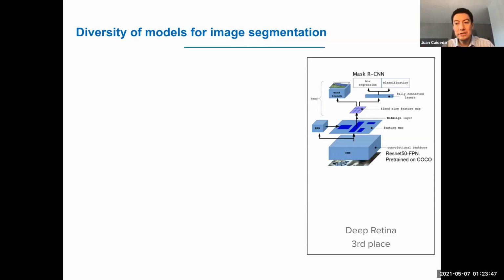We had the opportunity to interact with this person, and they shared all the configuration that they used. And according to their experience, there are a few parameters that make more of a difference for images of cells. And maybe those parameters were missed by the rest of the people. So calibrating those parameters. I think in general, being able to demystify it and basically turn it from an art to a science and say, here are the steps that you need to take. But if it's really an art and you have to try all these different parameters, then maybe that seems to be the case.